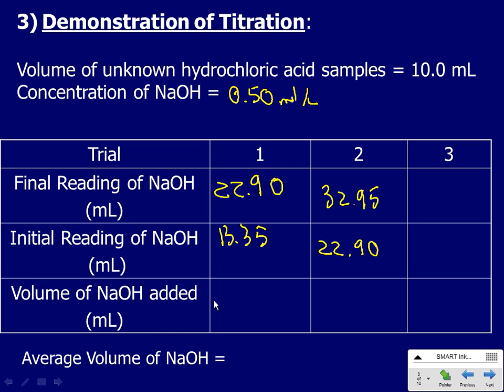Yep. 9.55 milliliters. Oh, don't put the milliliters in the table, folks. Milliliters goes in the heading. And how about this other one? Yep. 10.05. Now that's significant. I'm half a milliliter off. That's really a poor job. You should get them to be within tenths of a milliliter if you do it right.